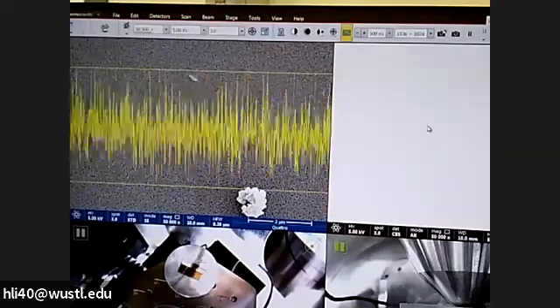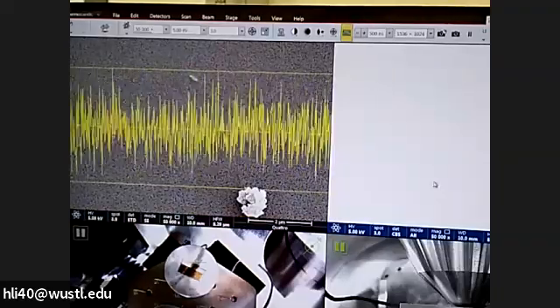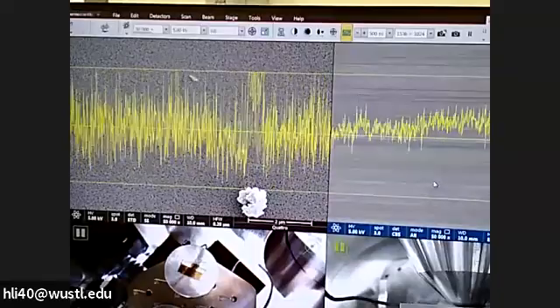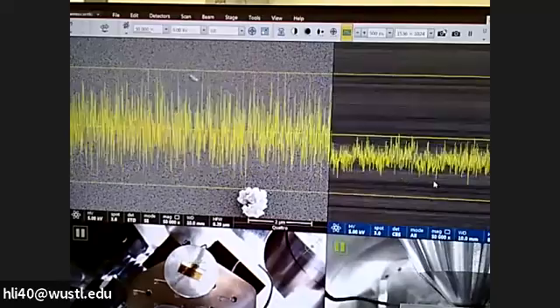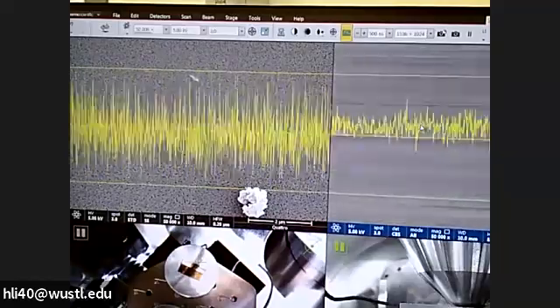And the same, if you want to adjust this one, you have to highlight it to make it blue. So now it's overwhelming to me, it's too bright. Okay, so it's very difficult. Why? Because we only use 5 kV. 5 kV should give you very good signal counts. I don't know why. It's supposed to give us very good signal counts. It's not good enough in my view. It's very bad. Okay, so I will see what's the problem with this detector.